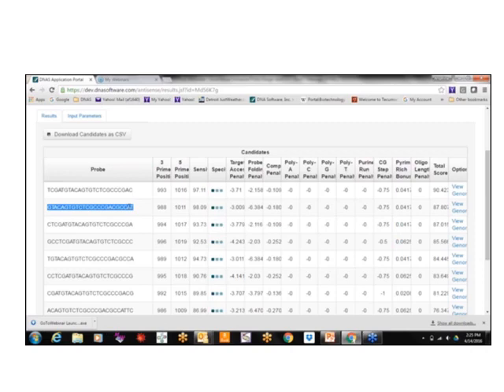We will have many results showing up. Basically, we will choose the one with the high sensitivity. This is the sensitivity, so we have 97, 98, so this one should be the best to be used.